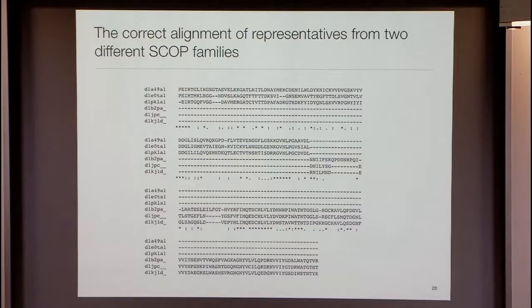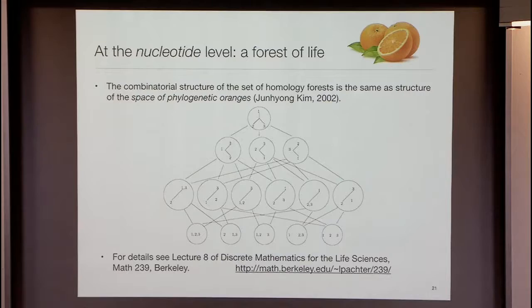In this kind of database, these kinds of alignments are important because often proteins have domains that don't relate to each other, or there are representatives in the database that are actually unrelated, and so you'd like to completely yank them apart. So there's an actual structure to this, and I'll stop with the sequence alignment in a minute because this is really a tutorial about read alignment.